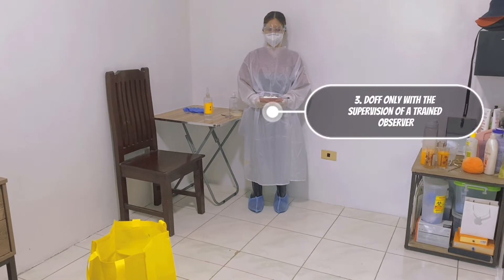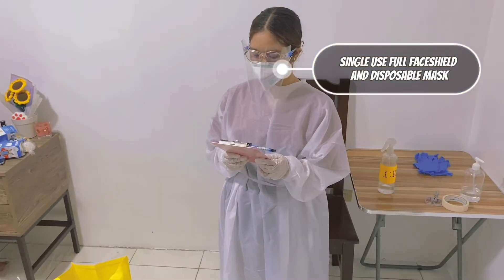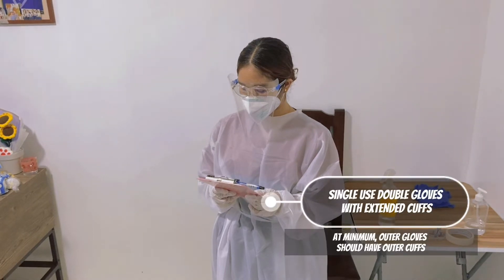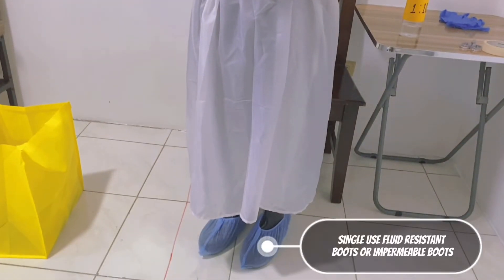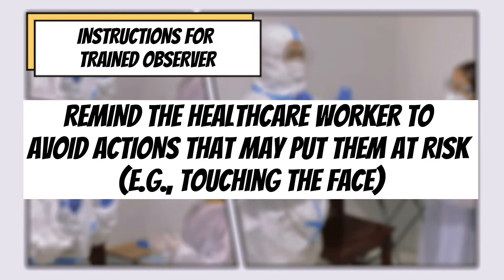Doff only with the supervision of a trained observer. Doff only with a mirror. Single-use face shield and a disposable mask. Coverall or a single-use fluid-resistant gown that extends below the knees. Single-use double gloves with extended cuffs; at minimum, outer gloves should have outer cuffs. Single-use fluid-resistant boots or impermeable boots.